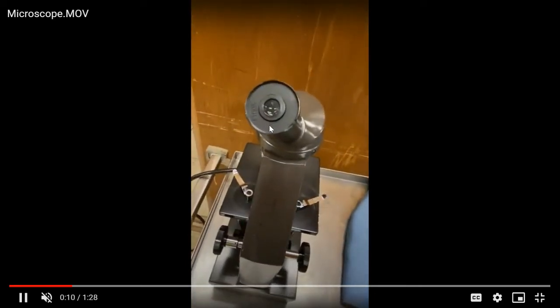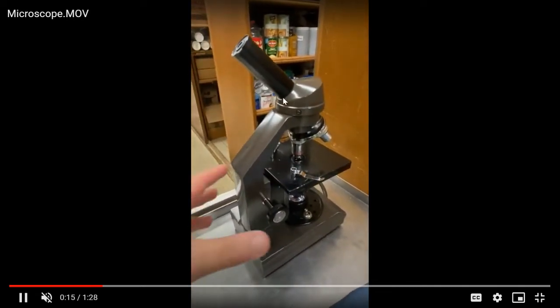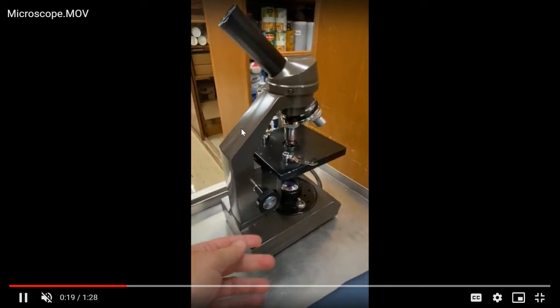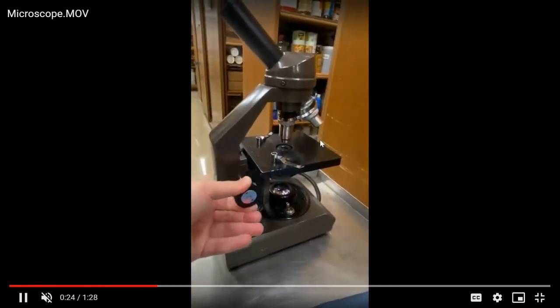Over here is what we call the arm of the microscope. That's what you'll hold onto while you're transporting it. Here is our course adjustment. You can see it moves what we call the stage up and down in order to get things into view.